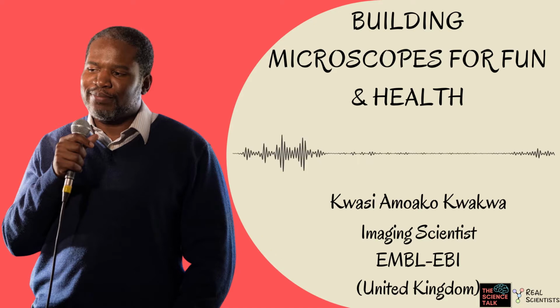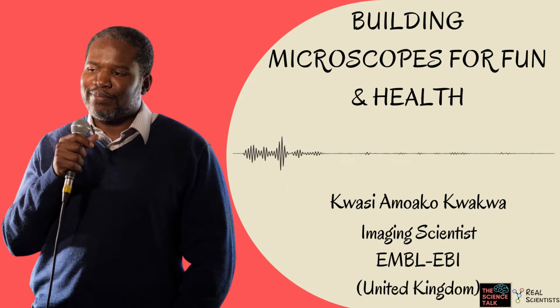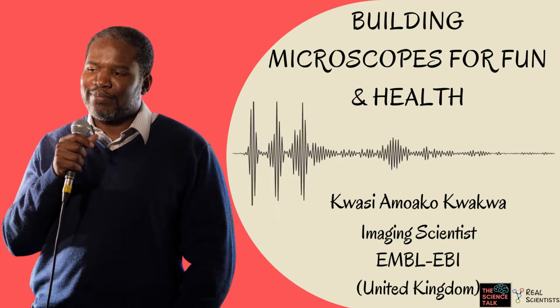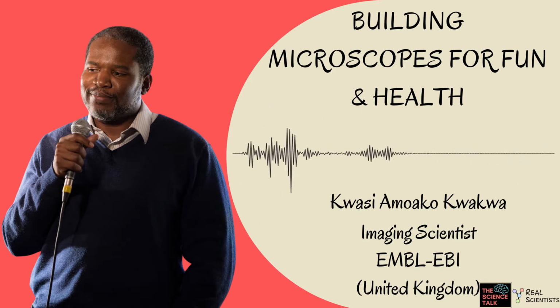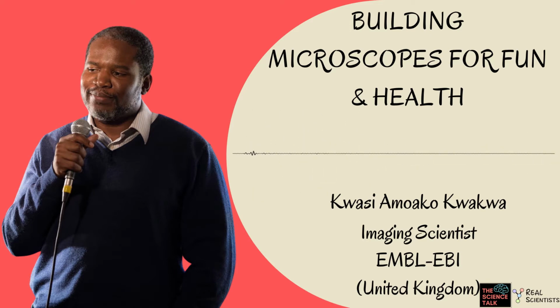The current job is building and managing microscopes at the European Bioinformatics Institute, which is a genetics lab. The thing they're most interested in is being able to look inside of cells that are inside of thin tissue sections to see what genes are active in each cell.